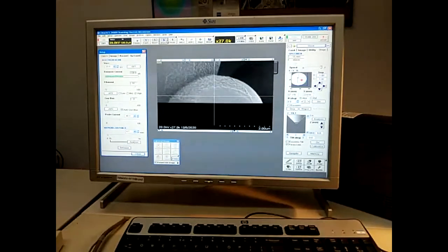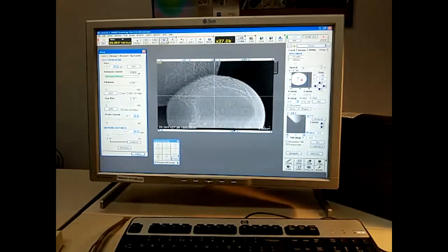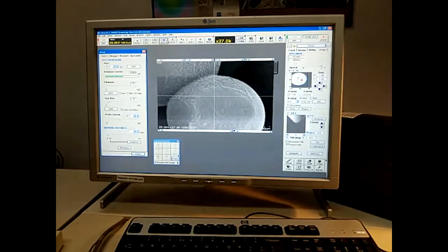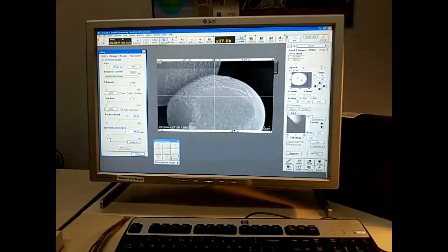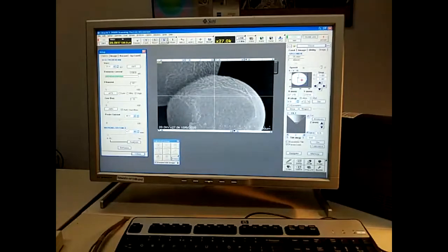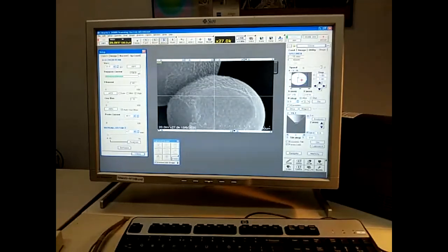Typically, we only use this microscope up to about 30,000 times magnification. In the neighboring vicinity down the hallway, we have a field emission microscope that's suitable for higher magnification. This machine was bought primarily for biological samples. It has a variable pressure mode that allows you to operate it on low vacuum with things that are damp or in various states of moistness.